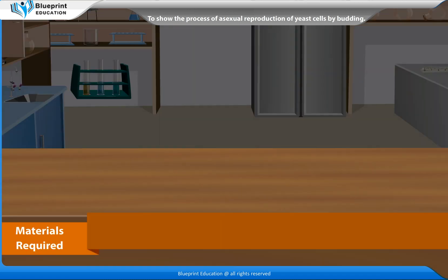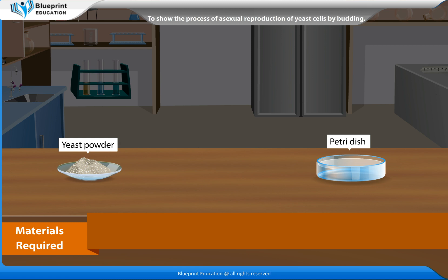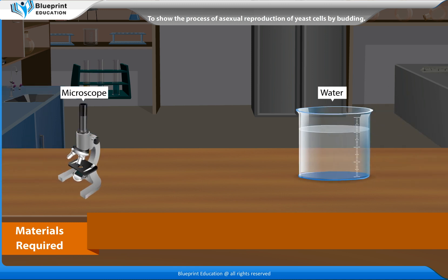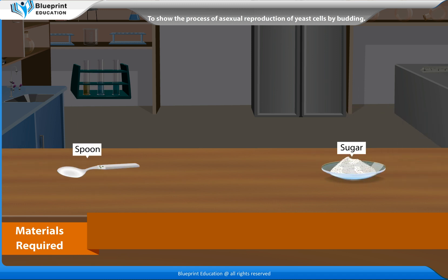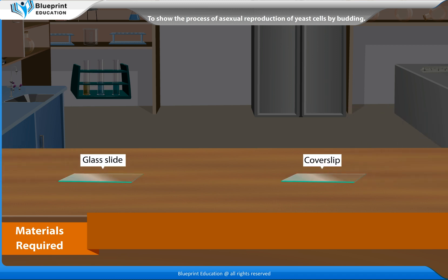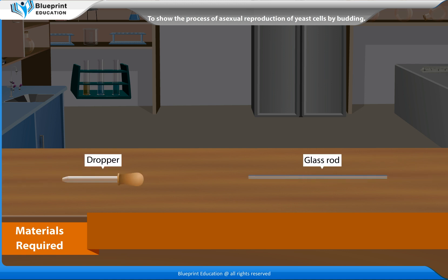The materials required are: yeast powder, a petri dish, a microscope, some water, a spoon, sugar, a glass slide, a cover slip, a dropper, and a glass rod.